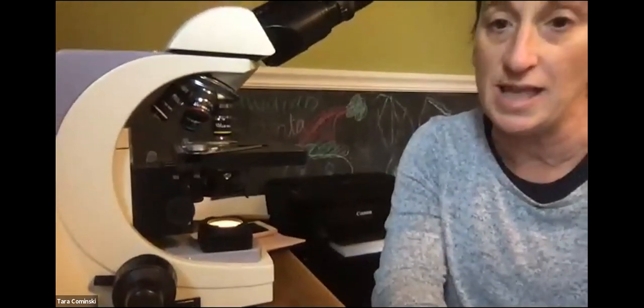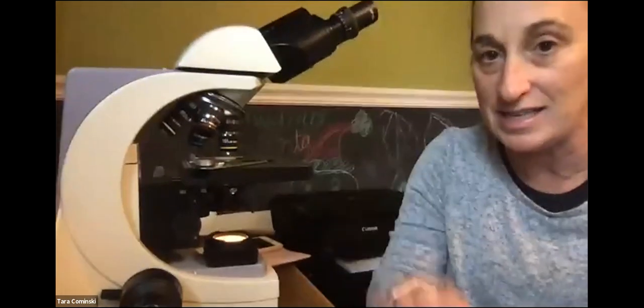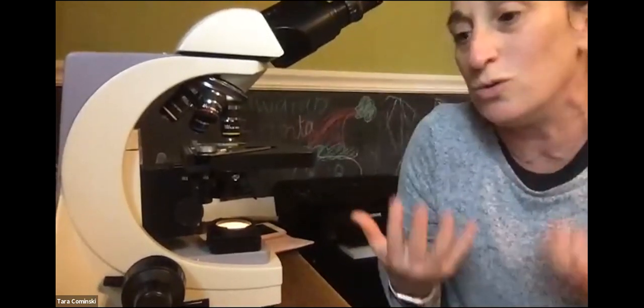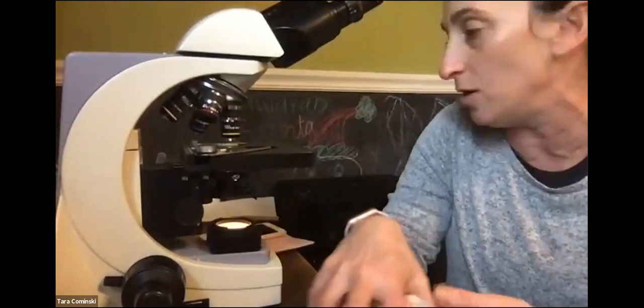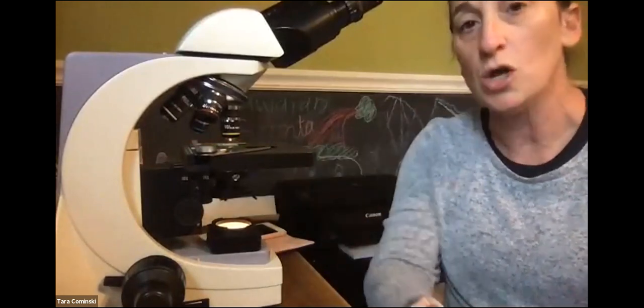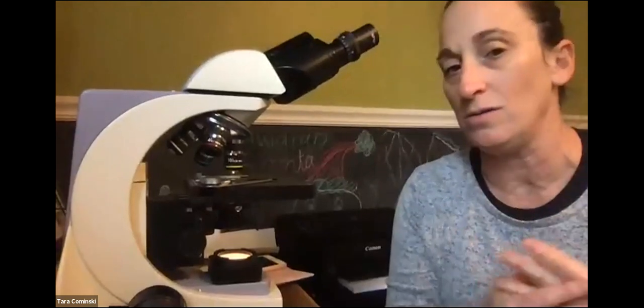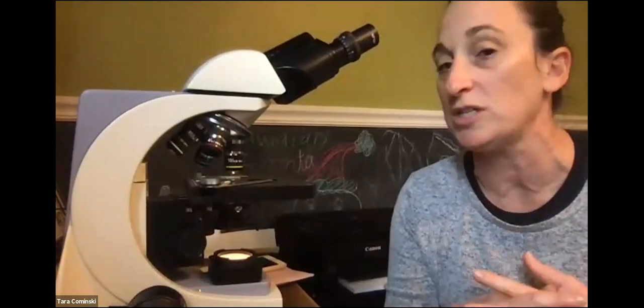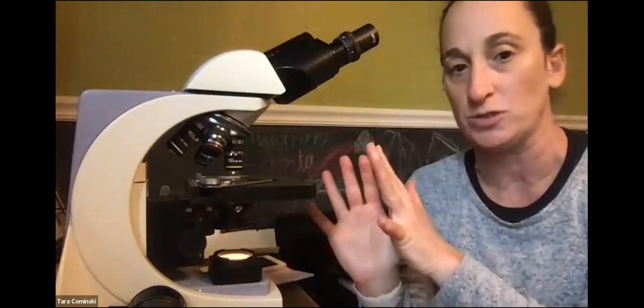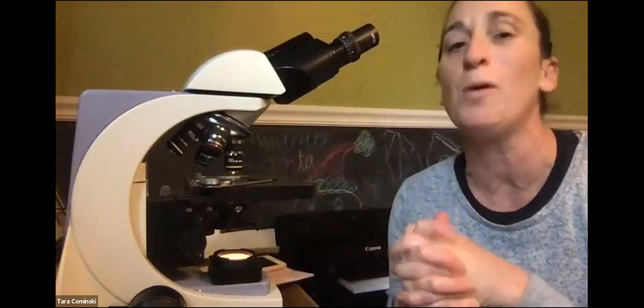And that is the microscope that we'll be using in this lab. This is an example of a compound light microscope, and that compound light microscope is what you'll use in lab. You'll use it a lot, you know, as you move through other biology courses as well, okay? So we're not going to have to know the parts of the dissecting microscope. We're really going to be just focusing on this microscope here, that compound light microscope. But we should know what the dissecting microscope is.